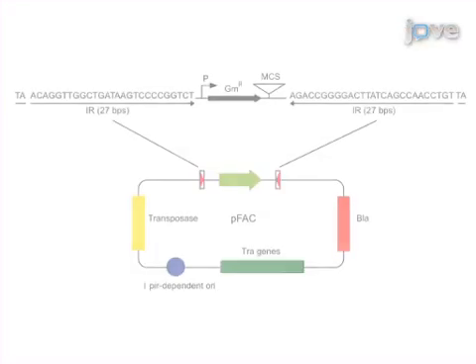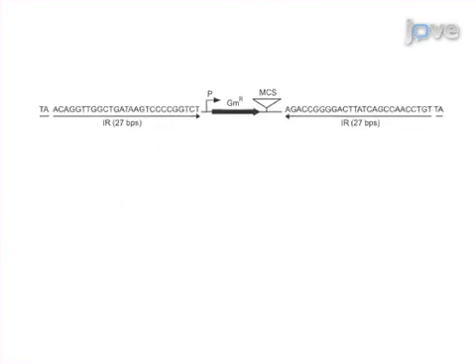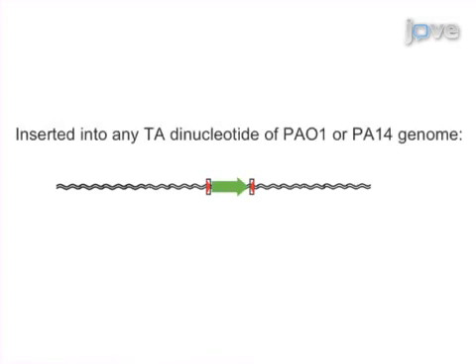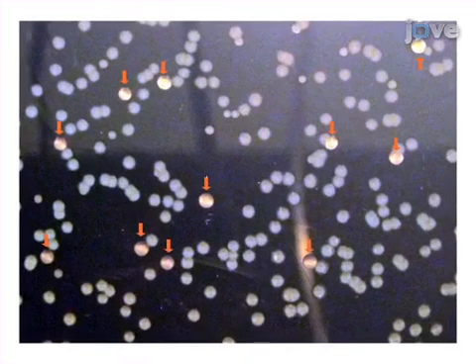Next, the PFAC plasmid is conjugated by co-culturing E. coli lambda pir with Pseudomonas aeruginosa PAO1, and transconjugates are selected on Pseudomonas isolation agar. Then mucoid colonies are identified and isolated on PIA plates.